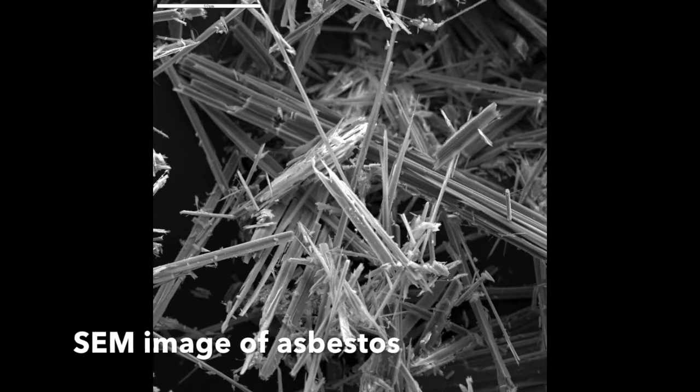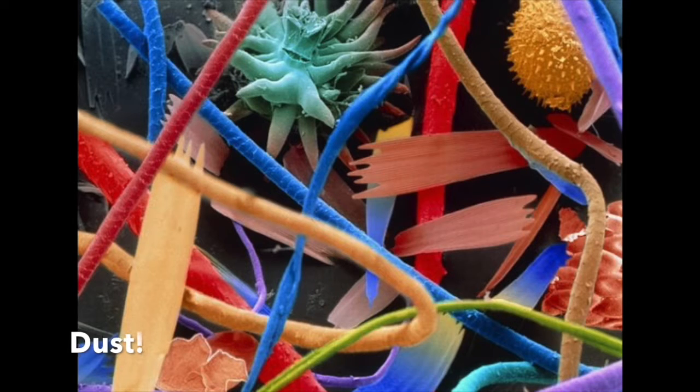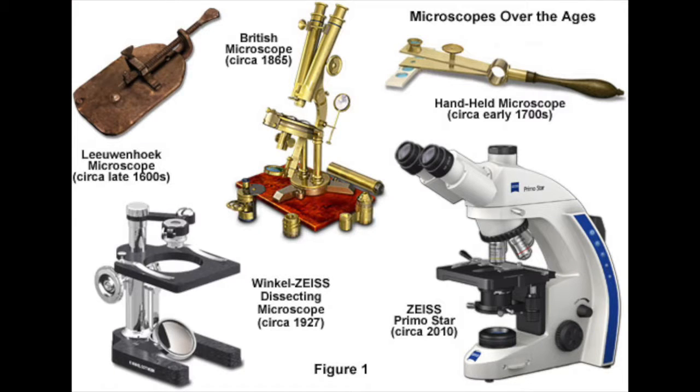One drawback compared to the light microscope is that the radiation from an electron microscope destroys living organisms, so today we will still use the light microscope to observe living cells.